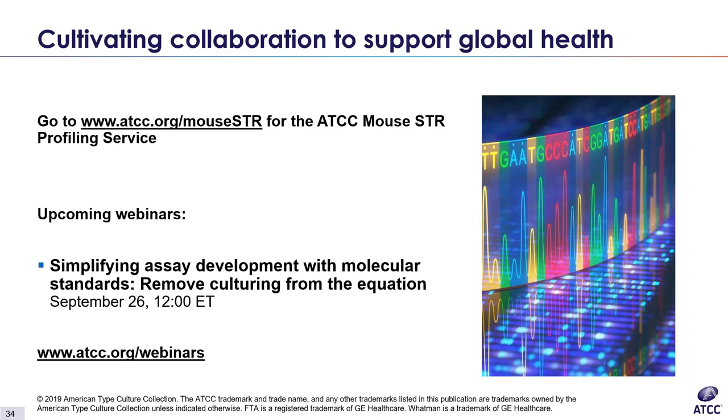Okay, this one's for Brian. I understand that STR profiling is only available for human and mouse cell lines. Do you have anything for cell line authentication for other animals? As a follow-up, are there other methods to authenticate cell lines besides short tandem repeat profiling?